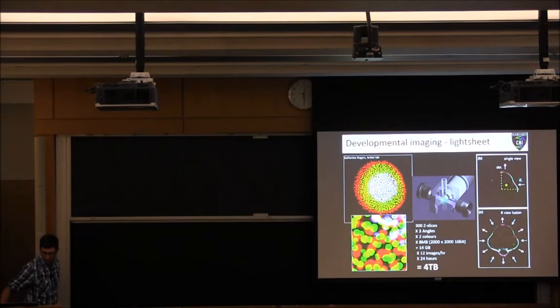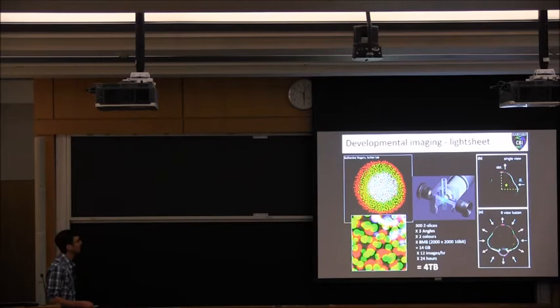If you're doing developmental imaging on the light sheet, you might be doing fairly small, standard light sheet Z stacks of just 300 Z slices. But if you're doing this on 3 different angles, of 2 different colors, you can see this quickly adds up as well to be many terabytes of data when you run this over a number of hours or days.